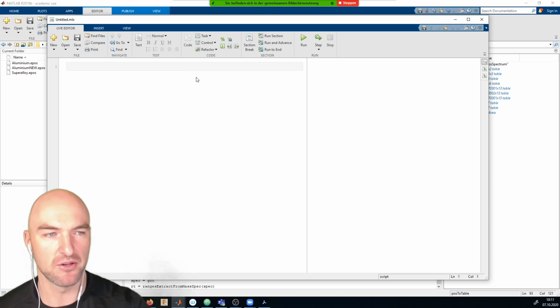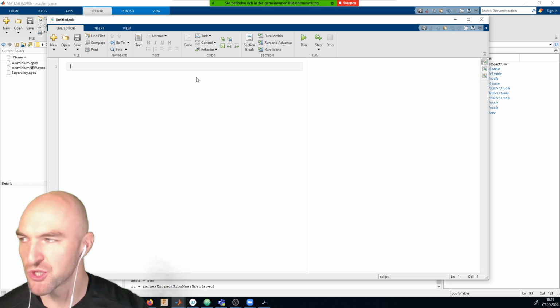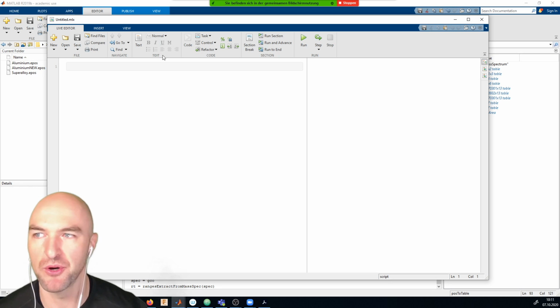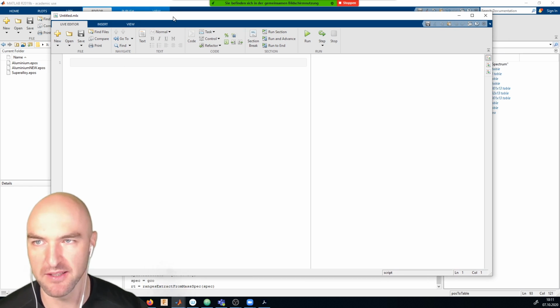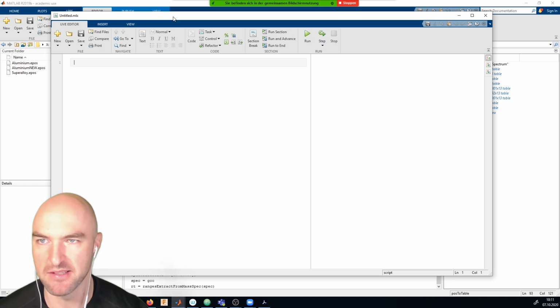And actually, Markus Kübach on Friday will show you how to use Jupyter notebooks to do your analysis. So if you jump over to Python, you will find it very, very similar.